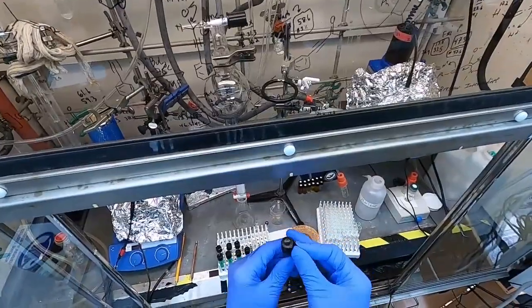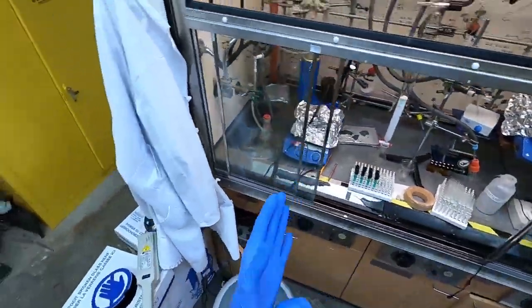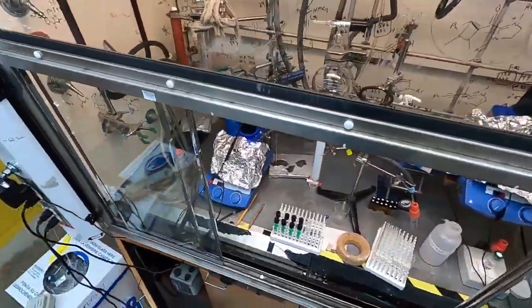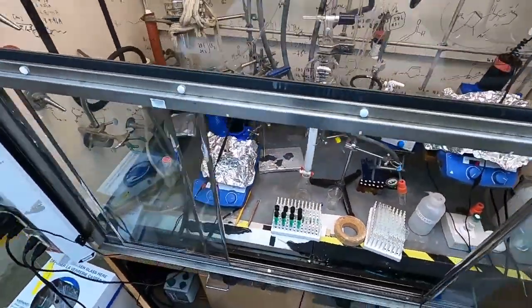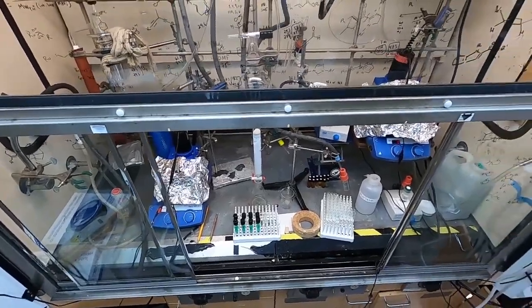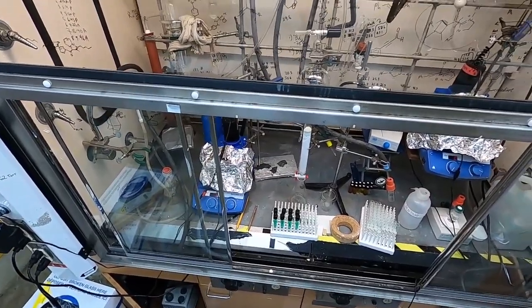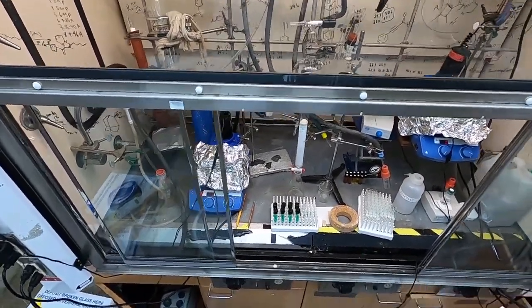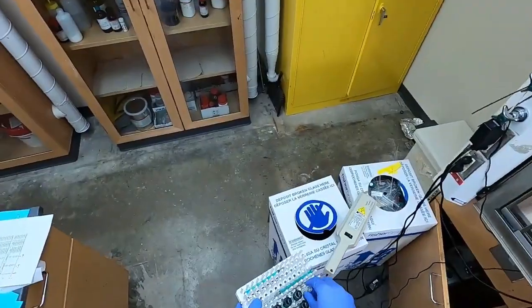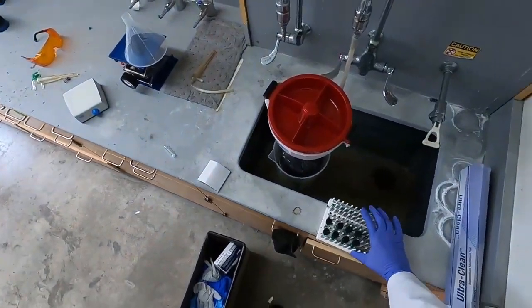The reason I have 3 more beyond that is because one of them is going to be my first isolation, right? I'm going to isolate it for the first time. I've never run the column before, and I don't know if the column's going to work. So sometimes your first isolation doesn't really go very well, and you use that isolation to learn how to better do the isolation. So for instance, you might run the column and you find out that there's a really close spot that maybe you didn't see on the TLC, or maybe the separation on the column wasn't quite as good as you wanted. And when you're doing isolations, we typically do them in duplicate, so that gives you one chance.